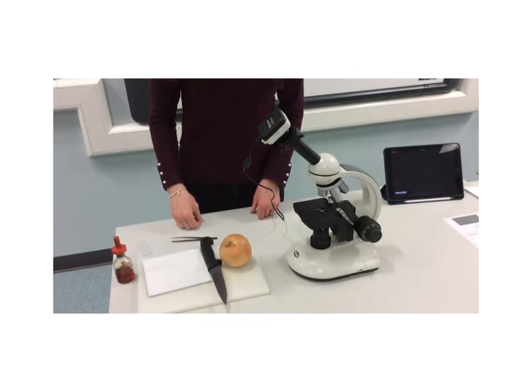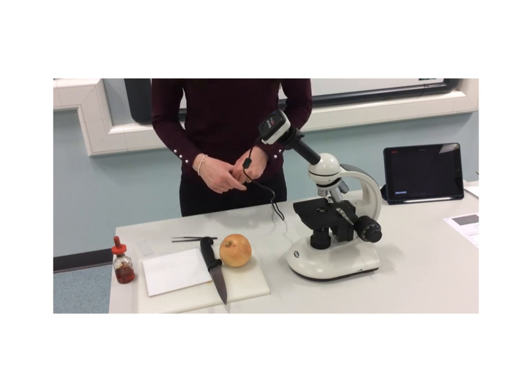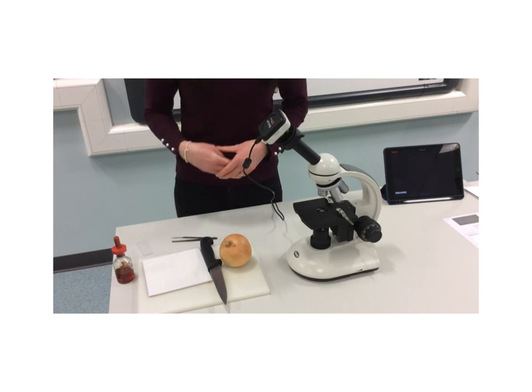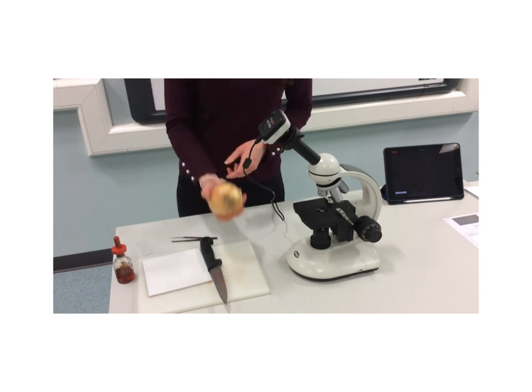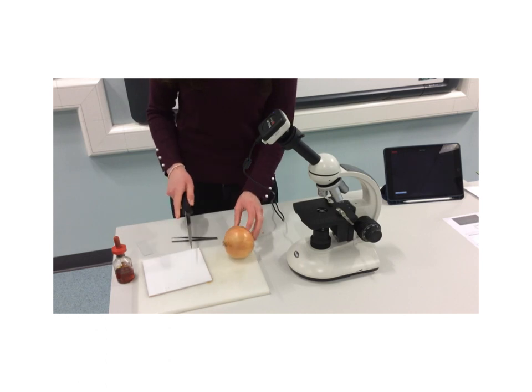So first form, I'm now going to show you how to prepare an onion slide, and it's really important that you know how to do this. Hopefully at some stage you'll get to do this, but for now I'm going to demonstrate it. What we basically want to do is see the cells in this onion. What we need to do is get a sample of those cells first of all.